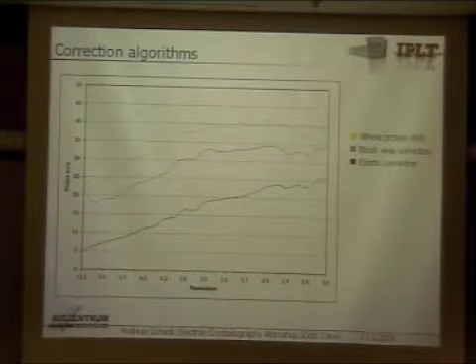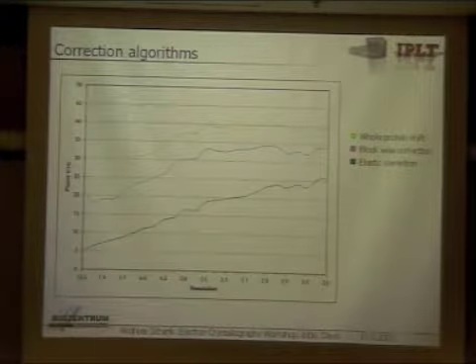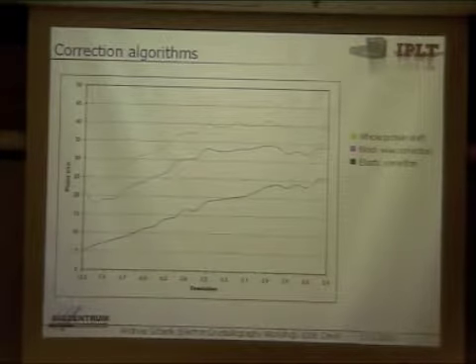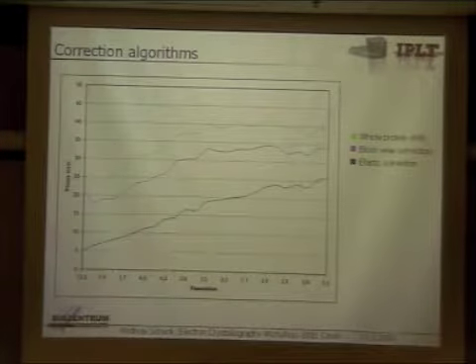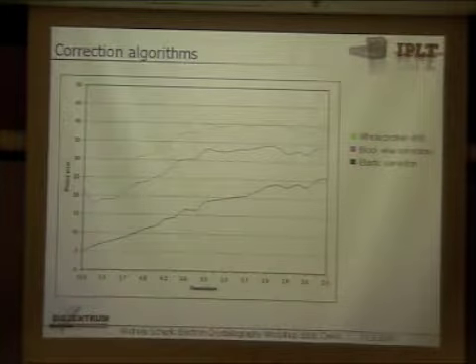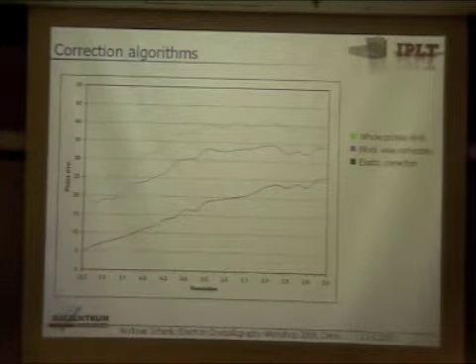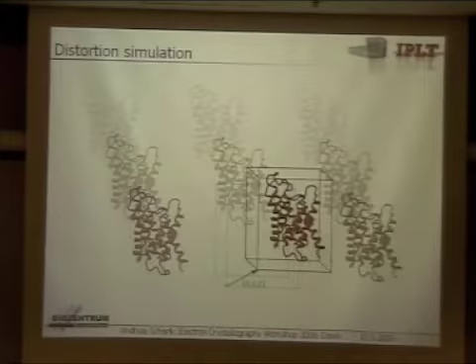When we do electron crystallography the conventional way and you calculate a Fourier transform of your on-band image, you don't really see much distortion in the CTF rings or any of this. And if you only phase flip, you basically just need to know whether your spot is on one side or the other of the zero transition.